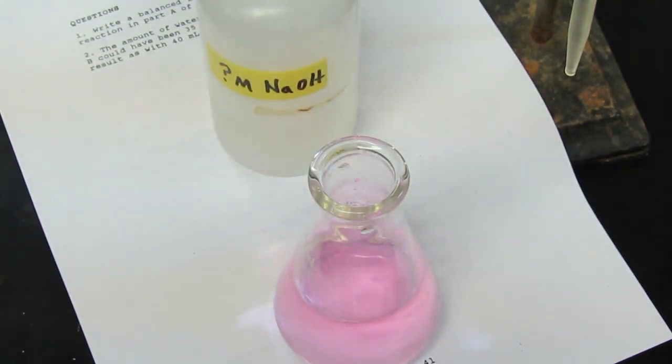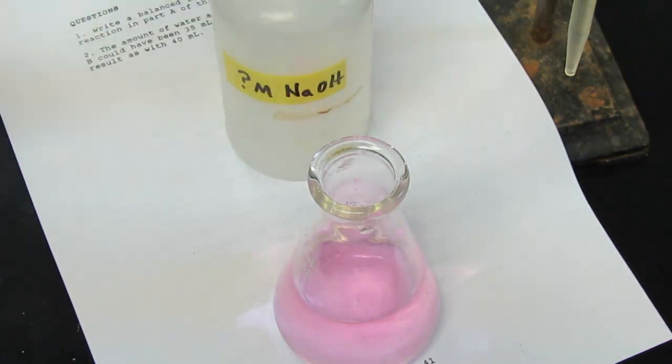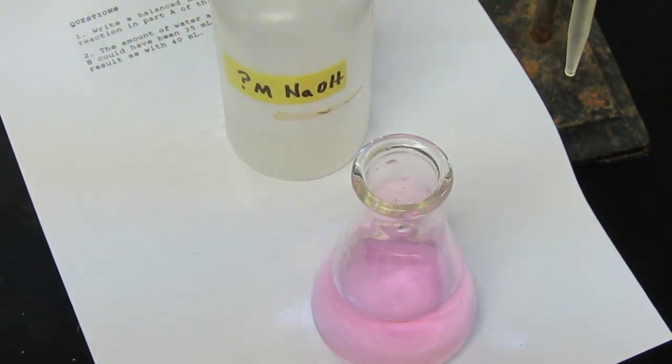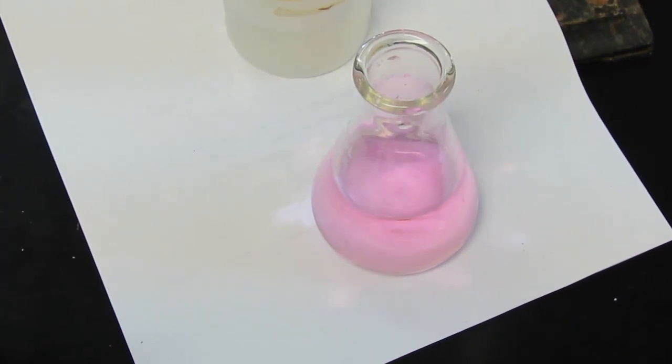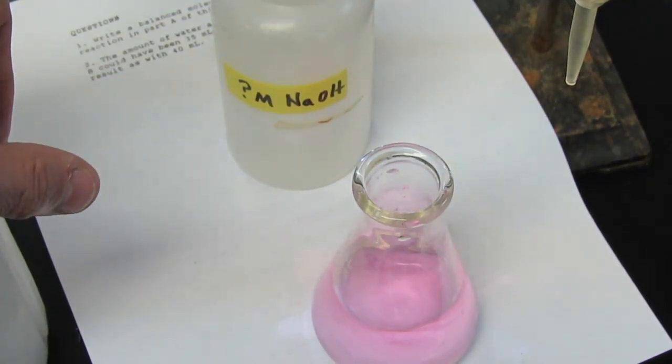In your experiment, you'll be required to do this three times and take an average. Now I did this earlier today in my classes, and we were getting 0.0907, right around there. Go ahead and try that calculation on your own and see if you get the same answer as I did. Once again, uncertainty lies in the last digit. So I would feel really good if I got 0.0909 or 0.0906, or even 0.0910 or something like that. We can't be off in that very last digit. All right. I hope you enjoyed this. It's pretty simple. You guys will have fun doing this. It's a skill that we use quite often in the first year chemistry lab setting. So thanks for tuning in. Bye-bye.